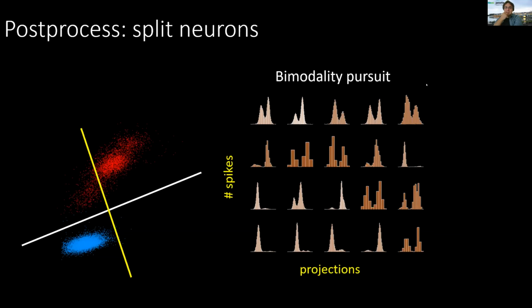That's right. Yes. So we've been going back and forth on this because the version that worked the best is in fact the version based on Kilosort 2, which does this kind of continuous tracking of neurons. So yes, Anna pretends it's all one day. It all gets registered to each other with the same drift correction strategy.